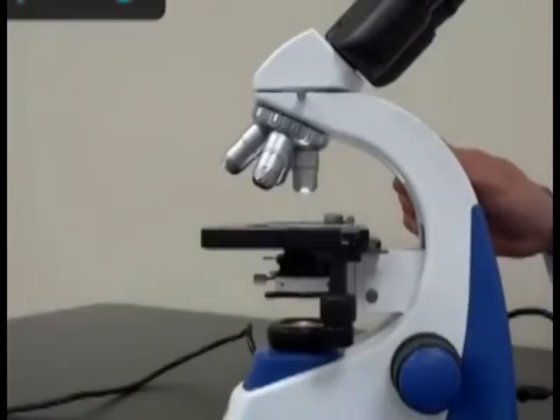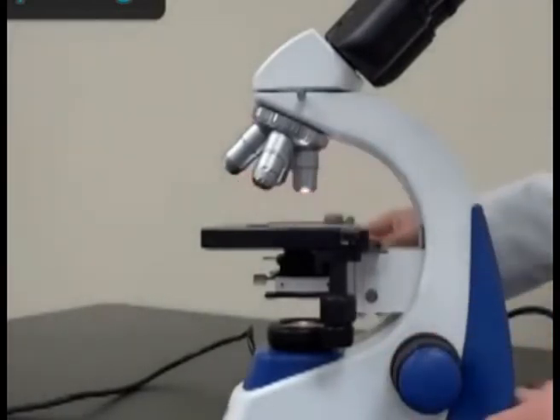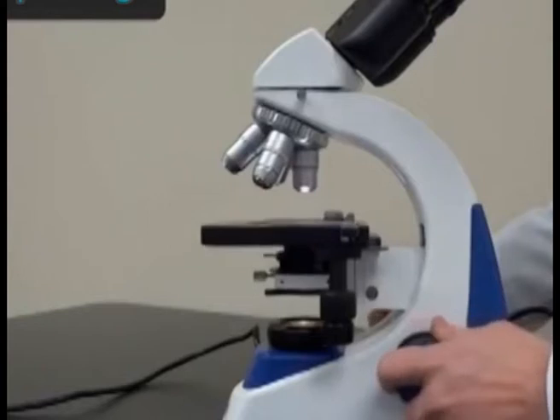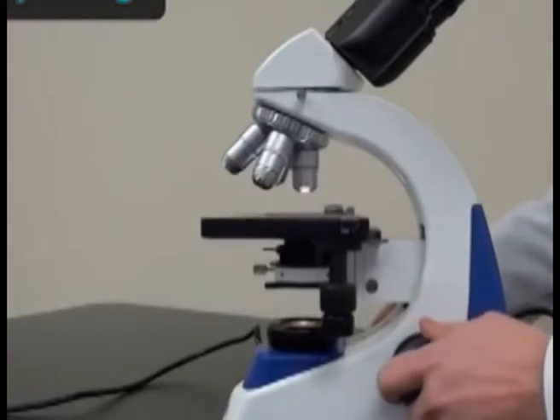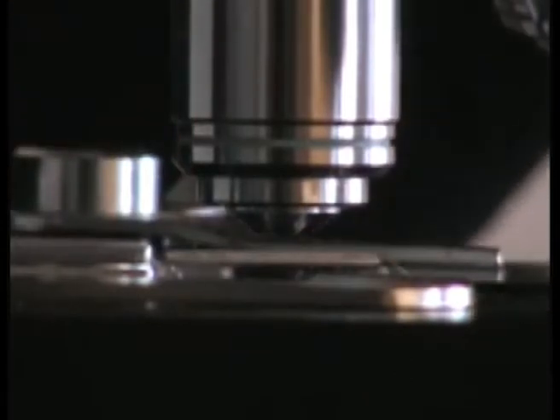In straight tube microscopes, a large knob on the upper part of the arm is used for coarse focusing and a smaller one for fine focusing. Generally, focusing is done by raising or lowering the microscope tube with its optical parts attached.